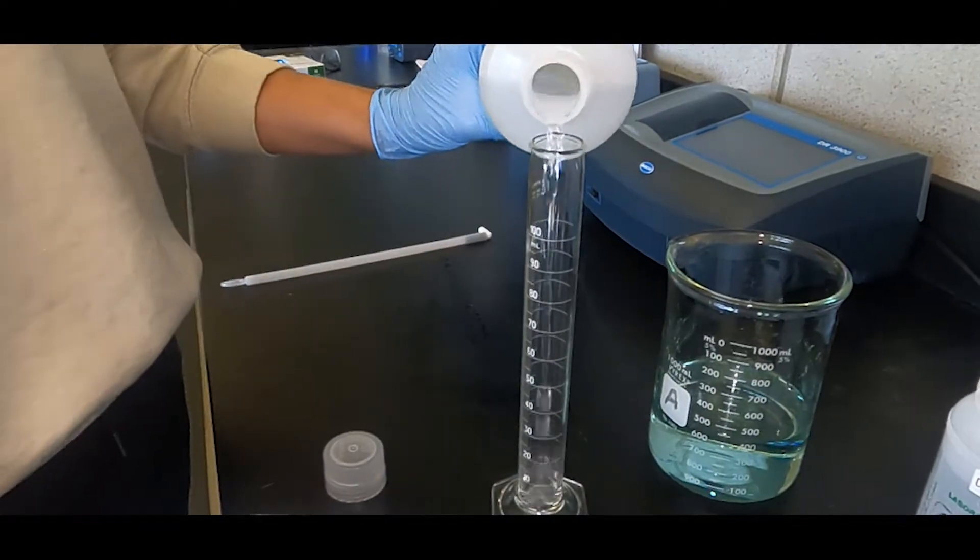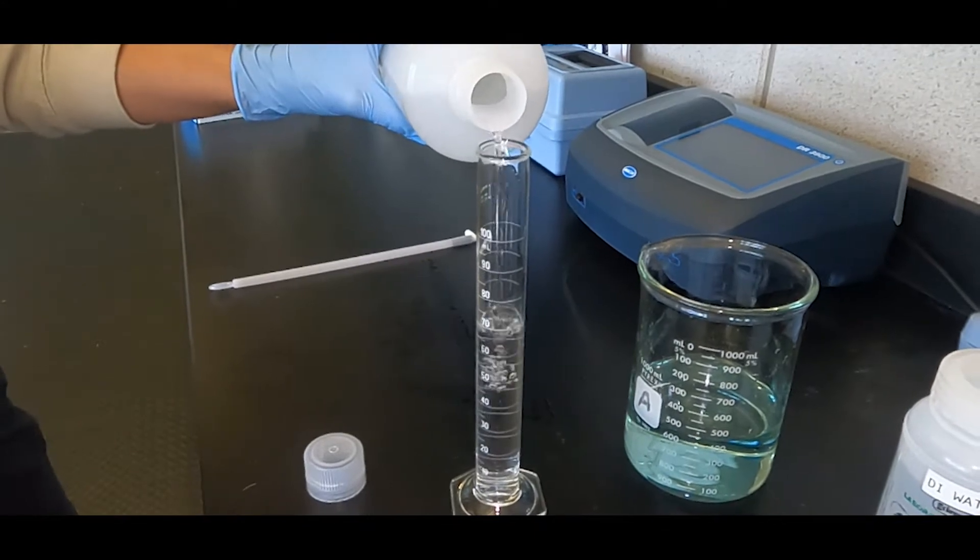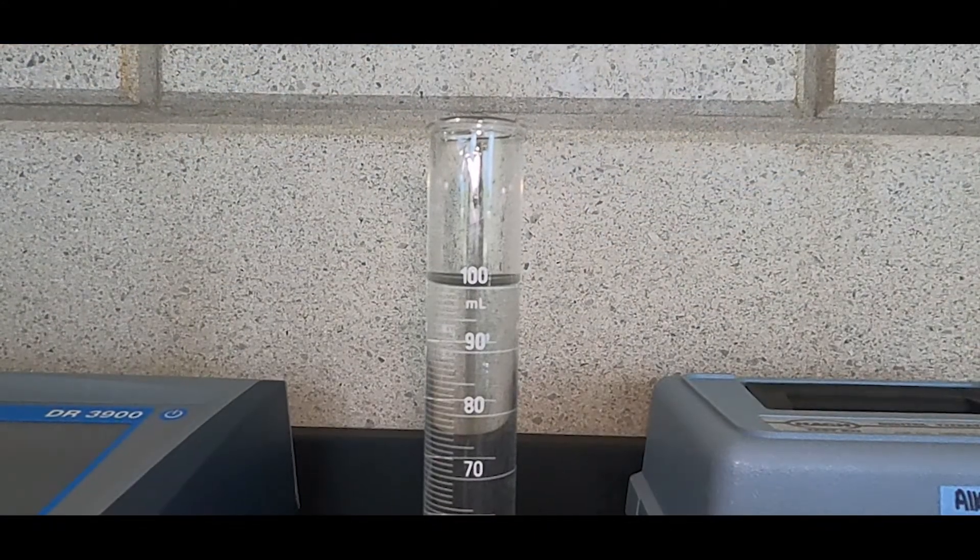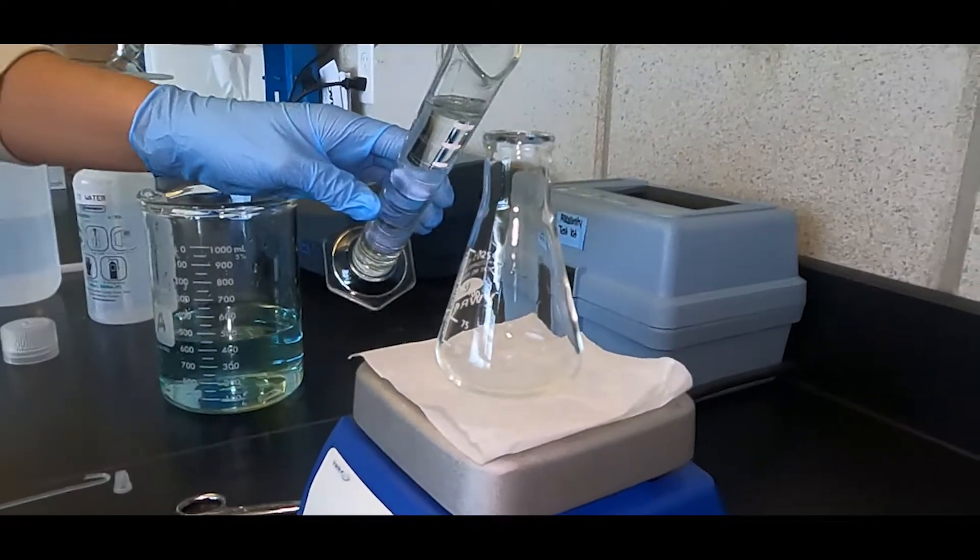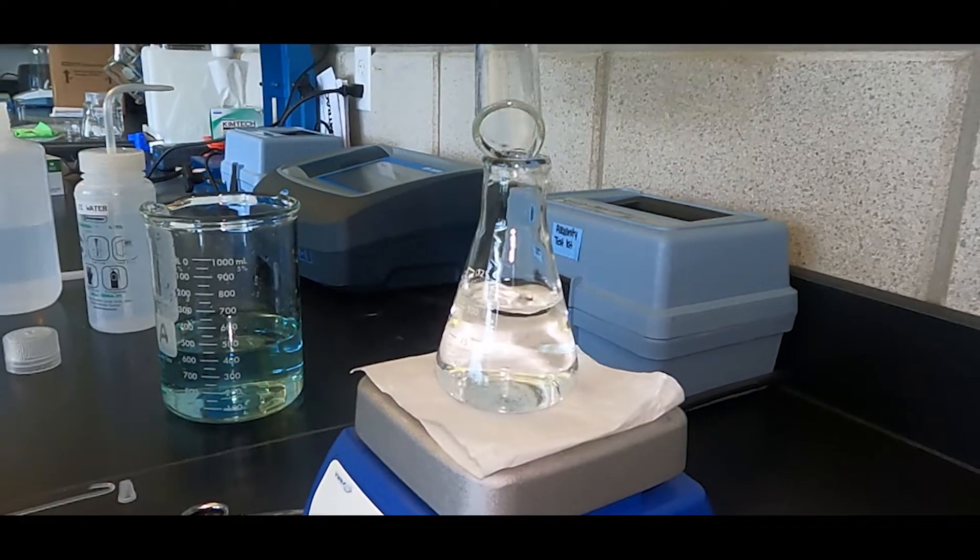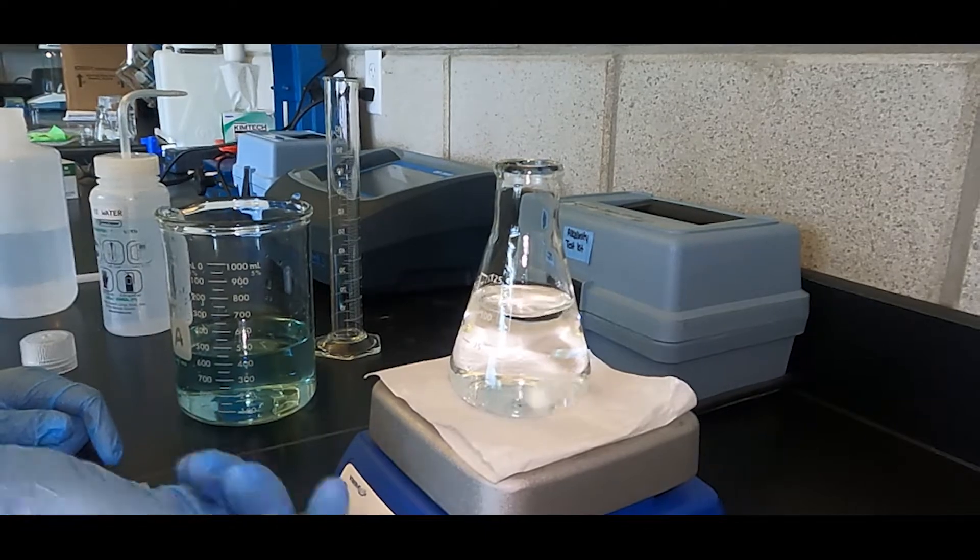If the sample volume given in the table is less than 100 milliliters, top the cylinder up to 100 milliliters using deionized water. Pour the sample into an Erlenmeyer flask and add a stir bar. Place on a stir plate and begin stirring the sample.